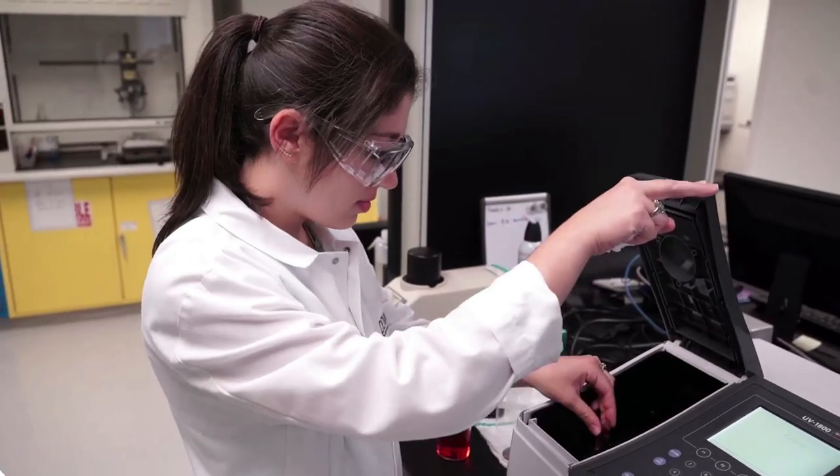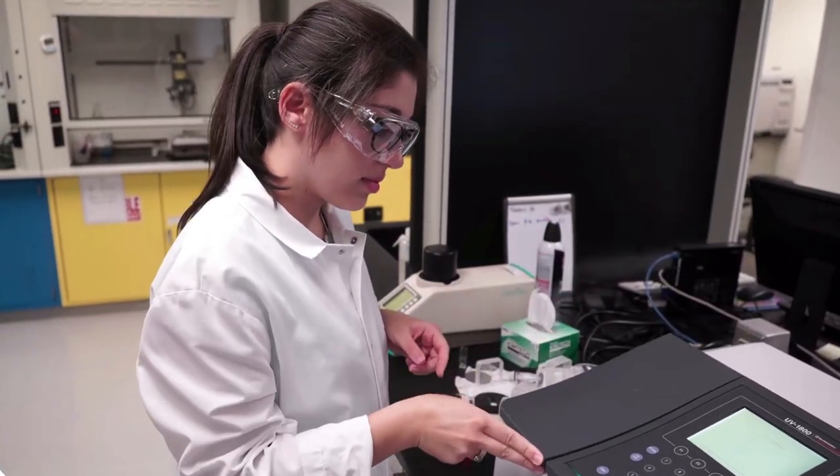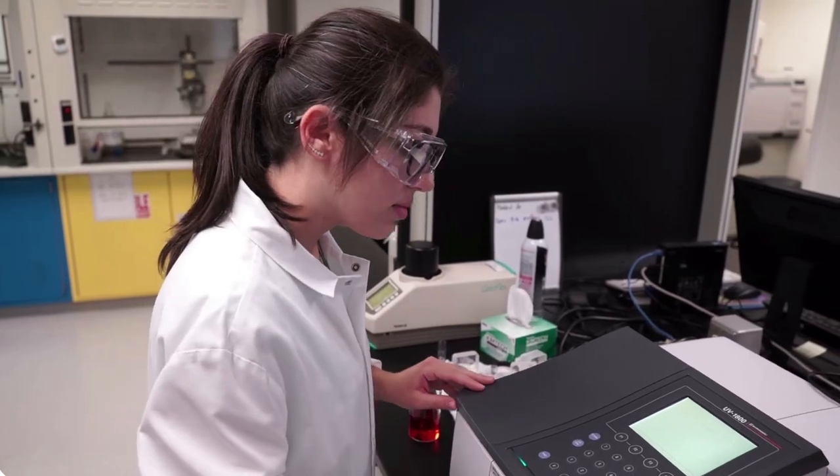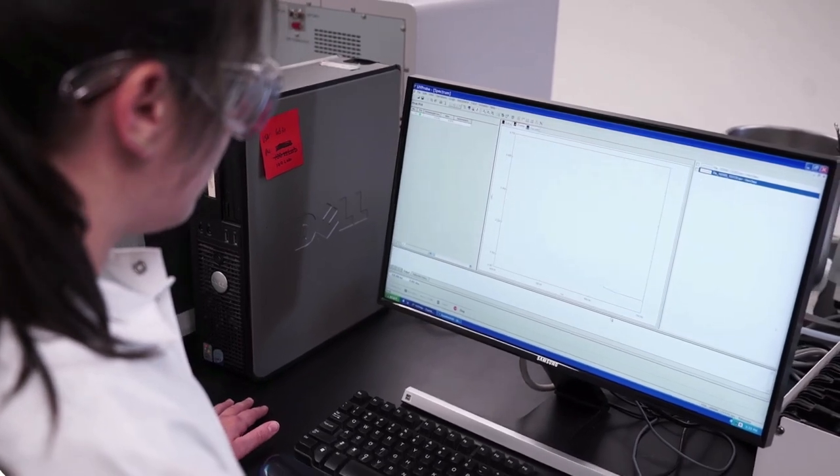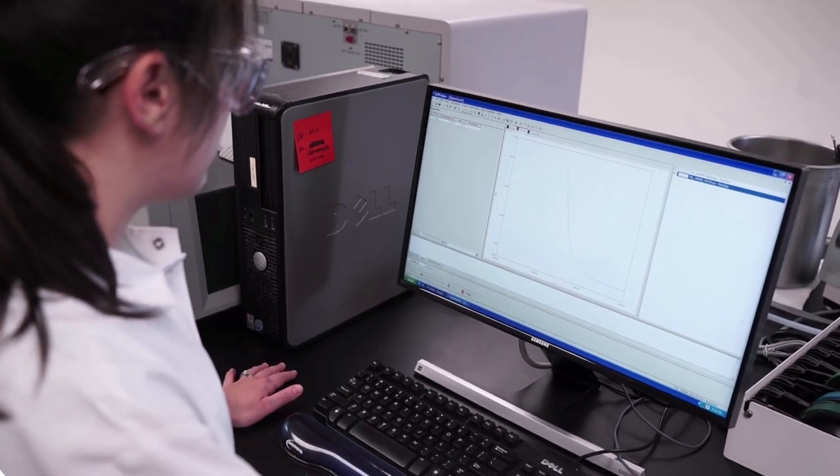We start by measuring the target color using a colorimeter. This machine shines light on the sample and measures how much of each wavelength is absorbed. We record this information as our benchmark and begin blending colors to match it.